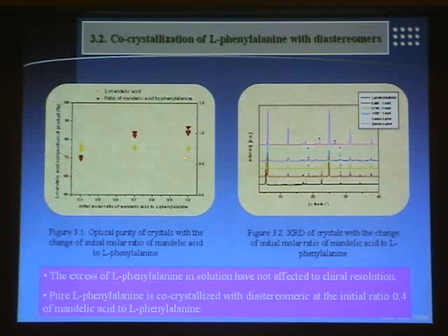However, the ratio of mandelic acid and L-phenylalanine in the obtained crystal changed a little at the sample 0.7 and 1. The ratio is 1:1.